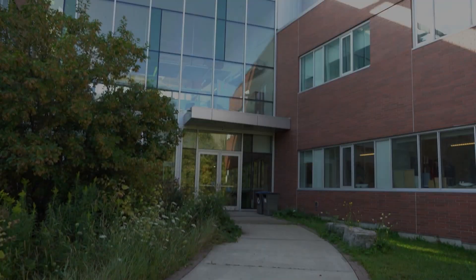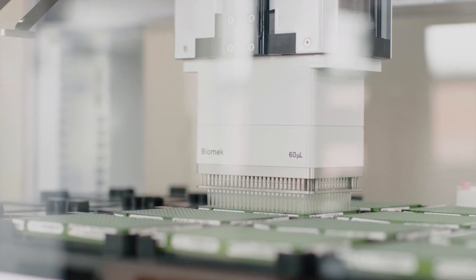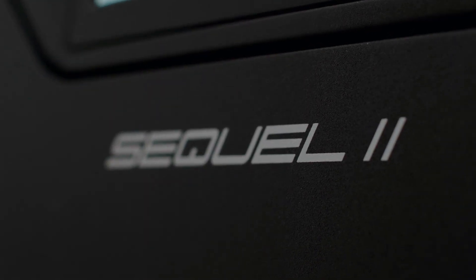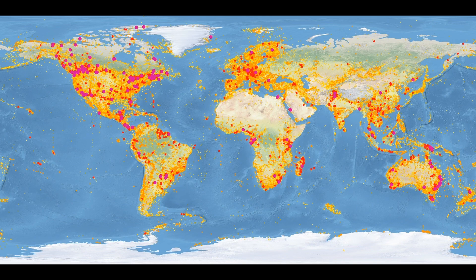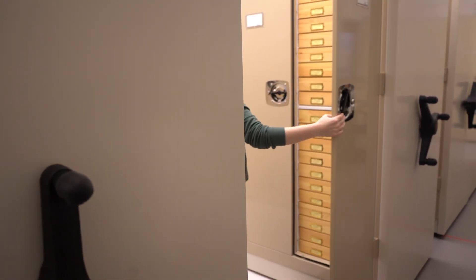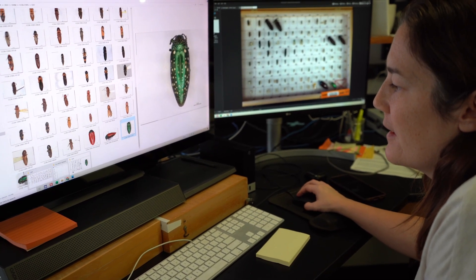The Center for Biodiversity Genomics at the University of Guelph is the home of DNA barcoding. Here, researchers are developing and refining protocols for biodiversity discovery and analysis. Museum specimens are an essential resource for understanding biodiversity and contribute to the DNA Barcode Reference Library. The Center for Biodiversity Genomics Collections and Imaging Experts will demonstrate a few key steps in the workflow for DNA barcoding museum specimens. This video is intended as a supplement to the protocols found in CBG's museum sampling instructions.